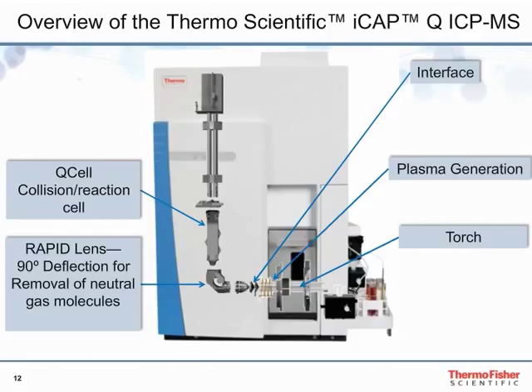The Q cell is a high-efficiency collision cell which uses kinetic energy discrimination and low-mass cutoff to reduce polyatomic interferences. The Q cell contains a flatopole with a reduced cell volume to improve ion transmission and to allow the cell to be rapidly pressurized and flushed during sample analysis. The mass filter is a quadrupole that efficiently filters all incoming ions to allow rapid sequential transmission to the detector, which is linear at over 9 orders of magnitude.